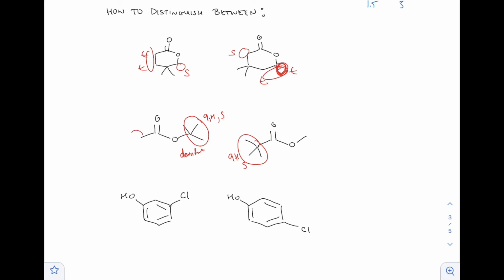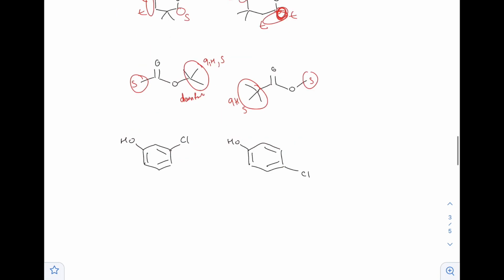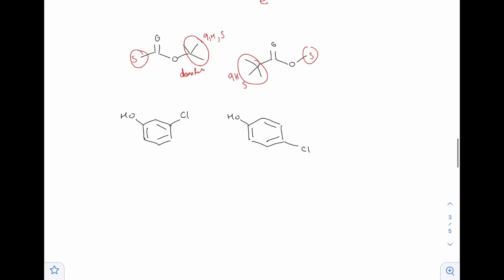And then same thing for that. We have that singlet for 3, and then we have that singlet for 3. We do have the nice number where we were talking just like above. The CH3 next to a carbonyl would add 1 ppm versus the CH3 next to this ester oxygen is going to add 3. So that's your difference, the location of that singlet.